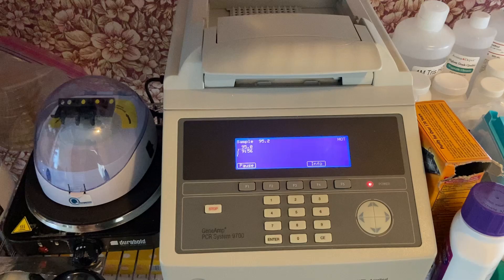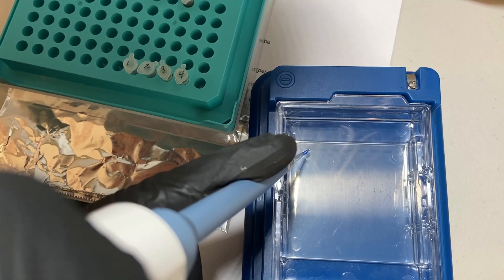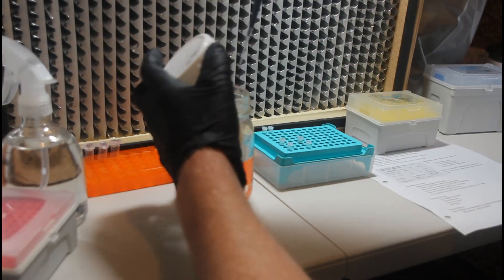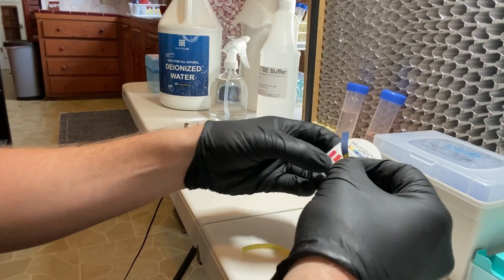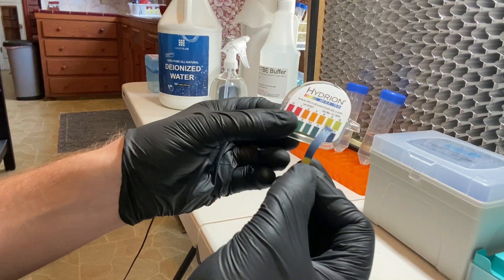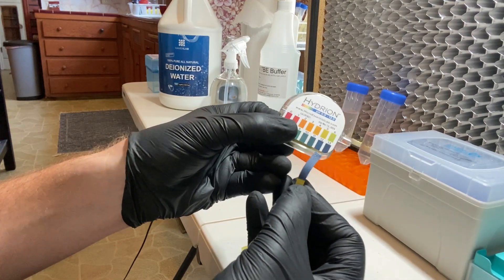DNA barcoding requires a baseline set of equipment and a variety of microbiology skills ranging from PCR, polymerase chain reaction, to using a pipetter, to creating dilutions of reagents, and so on. By learning DNA barcoding, you will expose yourself to a variety of foundational skills that will help you build a foundation for doing more complex science in the future.